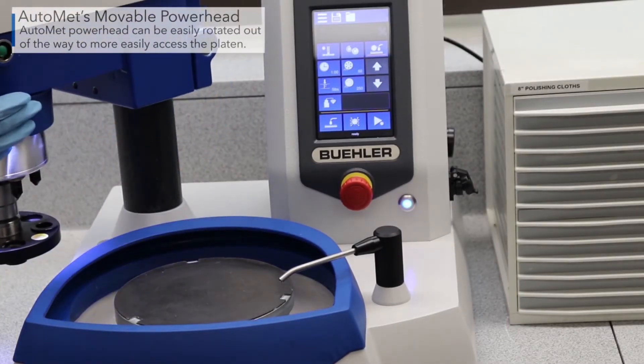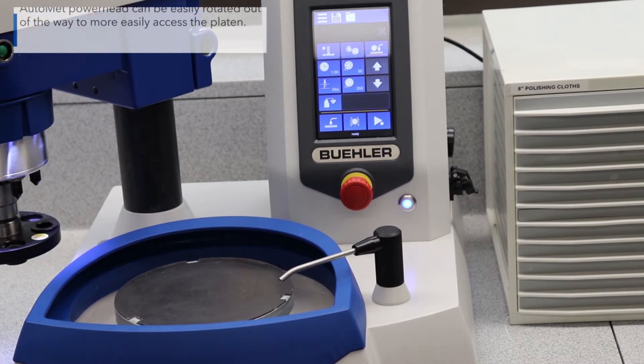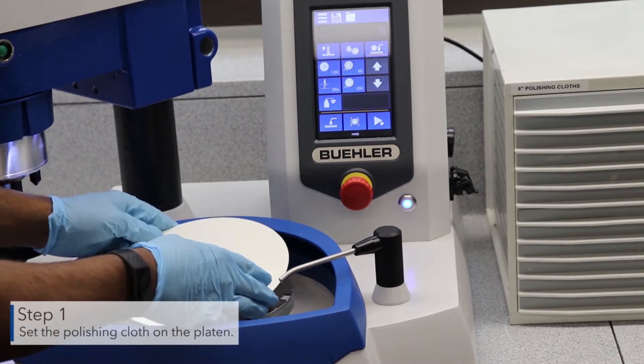Rotate the power head out of the way to more easily access the platen. First, set the polishing cloth on the platen.